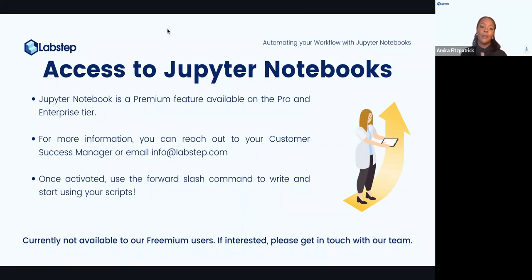We are here to help you. As we mentioned, we've got the entire customer success team and the entire implementations team, and we really are here to help you on this learning journey. As young scientists who haven't been in the industry very long, I'm sure, Ethan, you can agree with me that using code to analyze your data is something quite new, but it could be new for anyone at any stage in their career. So we are really here to help guide you, setting up your scripts and getting you started on using them.